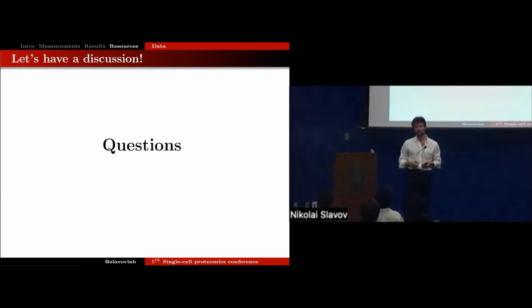So we certainly had some level of interference. There's always a level of interference in DIA label-free plexDIA, but we did not see a very steep increase in the level of interference at that point, at least when implemented on Orbitraps at the MS1 level. And because of that, I'm encouraged. I know we haven't yet reached the limit. Where that limit exactly is, I don't yet know.